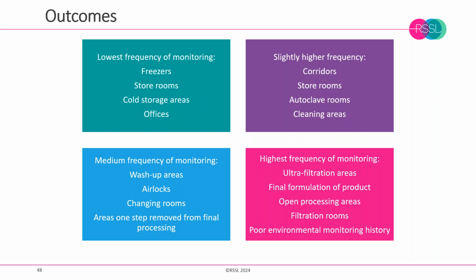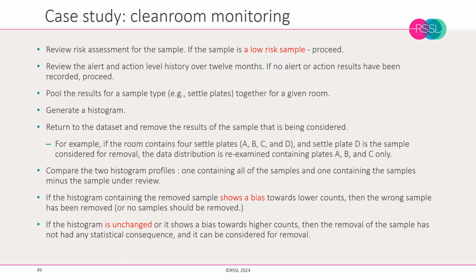Okay, so we're just going to move on very quickly to the second part of the presentation. This will be quite short, but this is about reducing environmental monitoring samples. So we have a clean room. This example is a grade D clean room with 4 settle plates taken in it, and we wish to remove one of those samples.